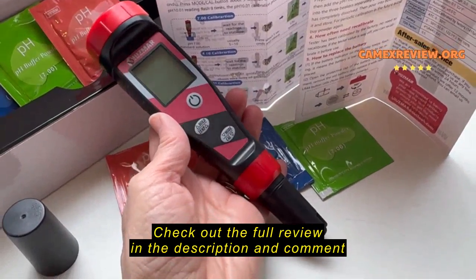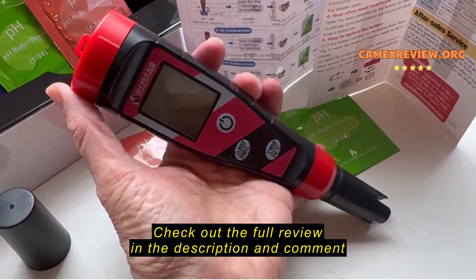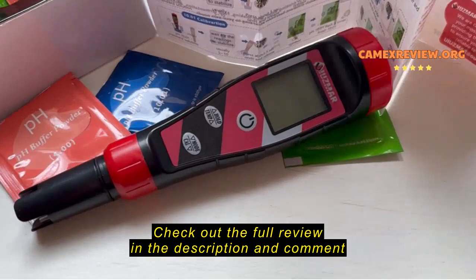I found it easy to use, and it already comes with a battery. It tells you how to replace it when necessary. Overall, I'm finding it useful, accurate, and very helpful.